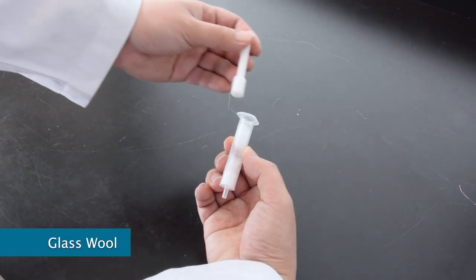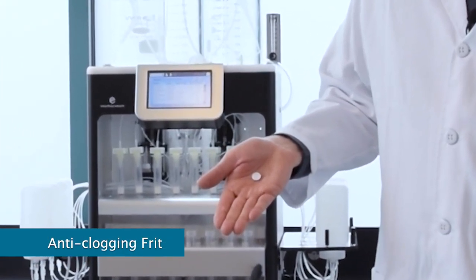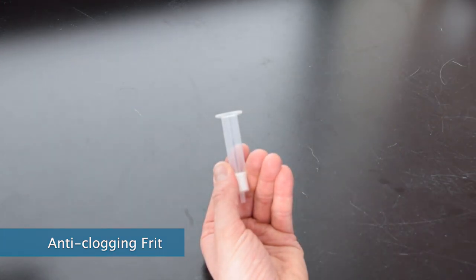I see. You know, that actually reminds me of when we used to pack glass wool in SPE cartridges to prevent clogging, in which case the samples and solvents would still flow through the glass wool and minimize any impact on recovery. That's definitely a good approach for manual extraction. And in fact, the draft method 1633 specifically calls for this measure. We have a more compact anti-clogging frit for the same purpose, and it can be easily inserted into any standard cartridge. However, using the inline filters is a further step to keep particulates out of the entire system.